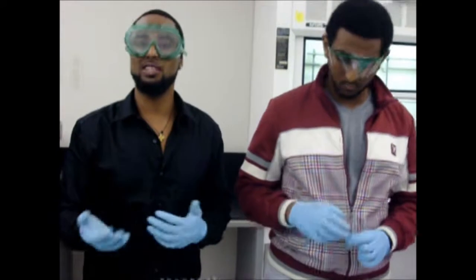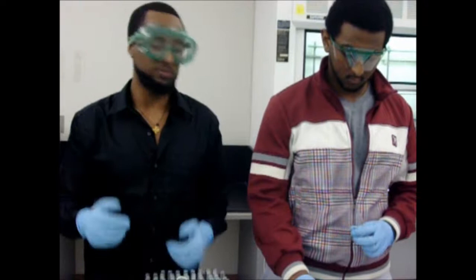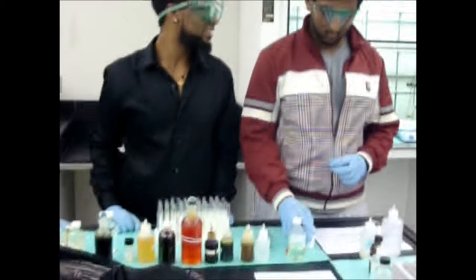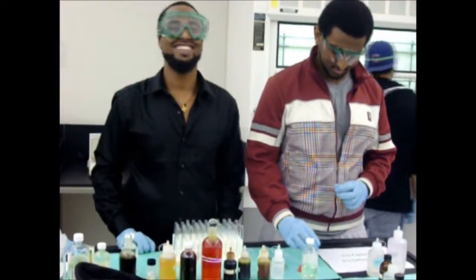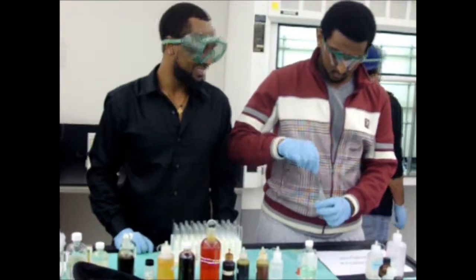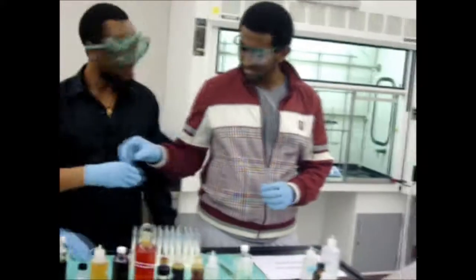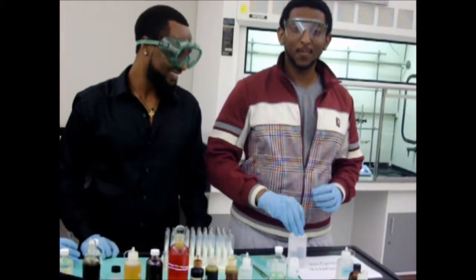So for comparison, we will get some HCl and the original lidocaine product that we were testing and see what the pH is around. And then we will compare the two. So, sir, can you please put some lidocaine in that test tube for me? Thanks. Here you go. One drop of HCl.